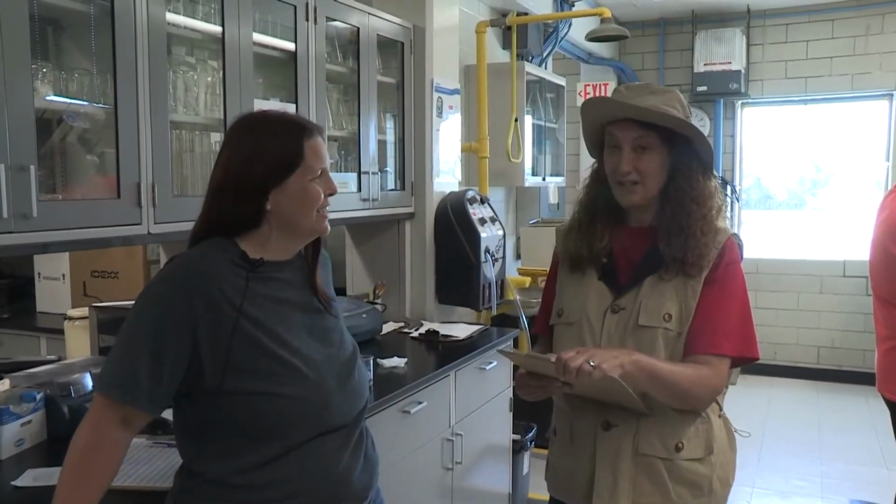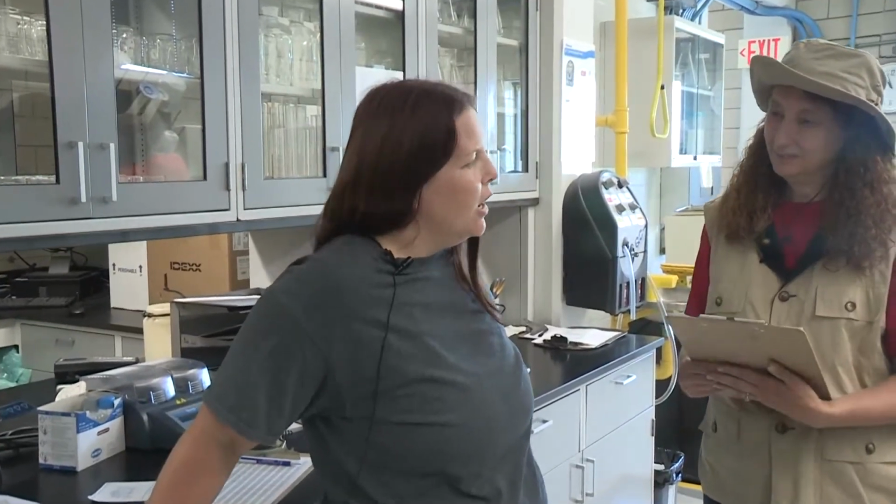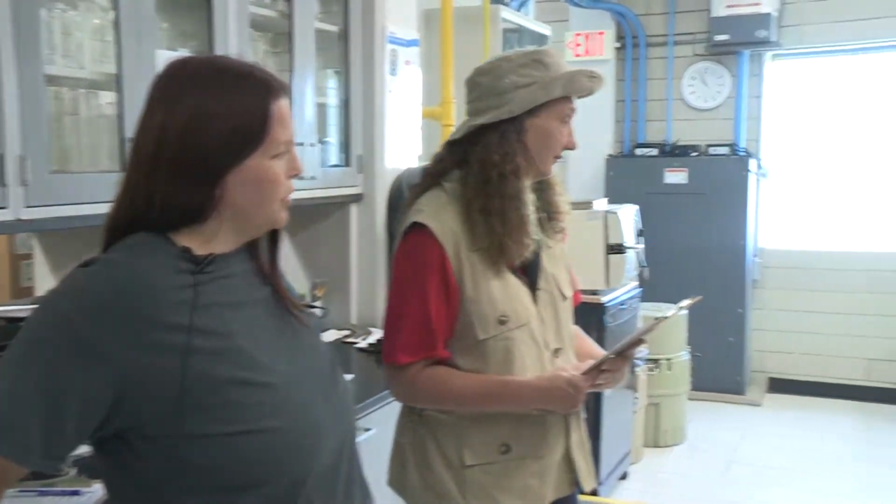So we do some simple tests like pH. We test how much solids is in the water. Then on top of it, we do ammonias and phosphorus, and these are all things that we have to pass to make sure that it is treatable and it is clean for the river. So Aaron, can you tell us about some of the tests that you run to make sure that the water is good for return to the river? Yeah, so we do pH, solids, ammonia, and phosphorus every day, and then right now he is running a chlorine sample.